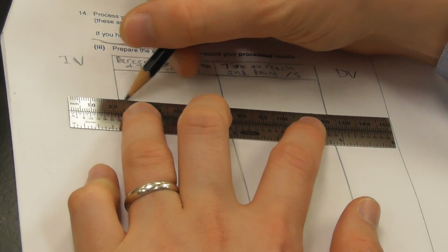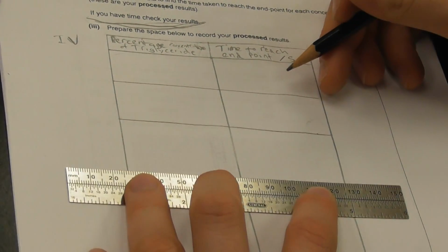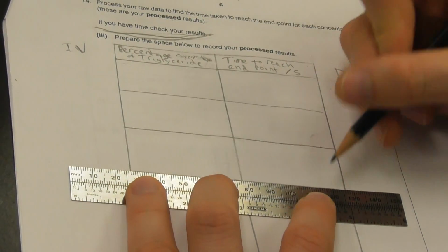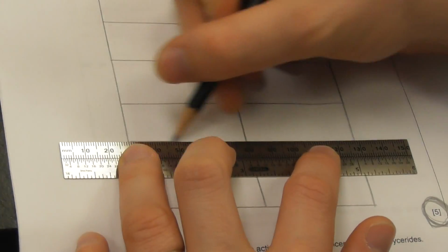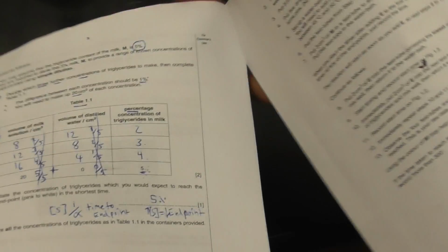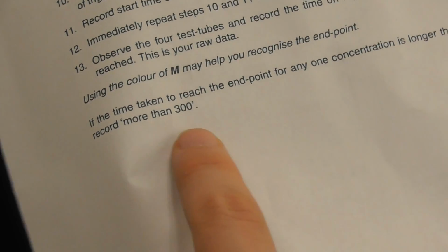So I had 5, 4, 3, 2, and M. Now, remember, they did say that if the time taken to reach endpoint for any one concentration is longer than 5 minutes, record more than 300. Using the color M may help you recognize the endpoint.